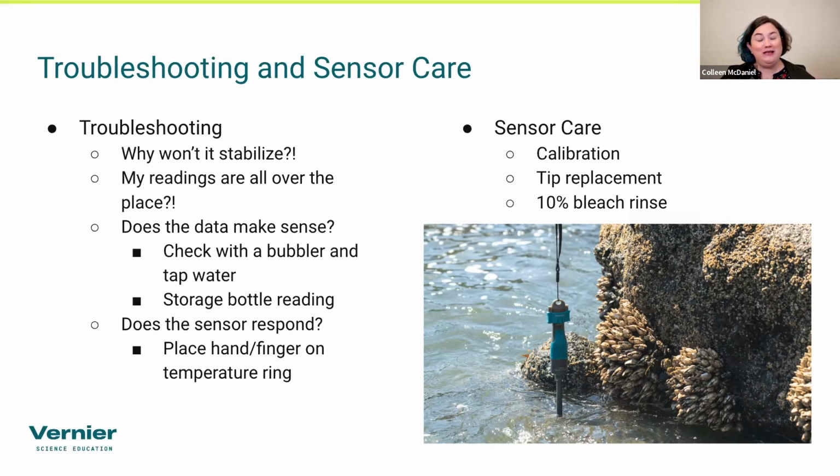And that's just primarily because these are electronic devices. You are going to have some electric noise going on. There might be some agitation going in the water. There's a lot of factors. So one of the things I always do when I do data collection with water quality and water readings specifically is I usually count down from 5, because over time the readings will pretty much stabilize, but they might do this little wavy thing where you're seeing jumps back and forth in either the tenths or the hundredths place.